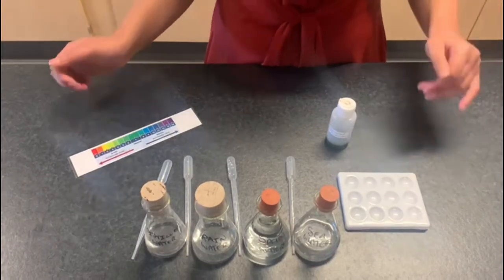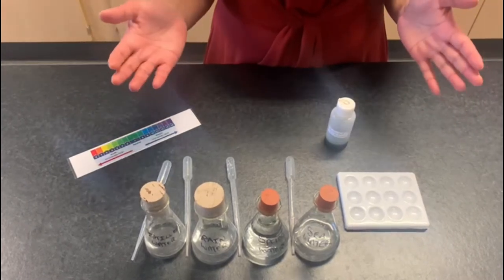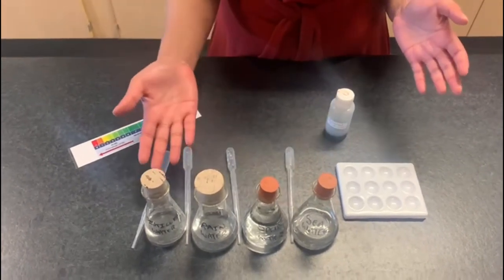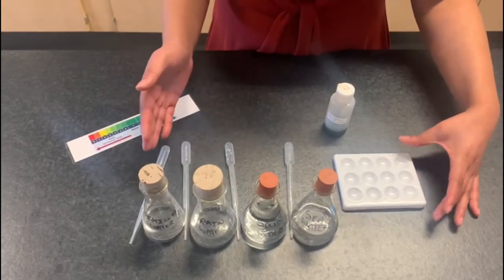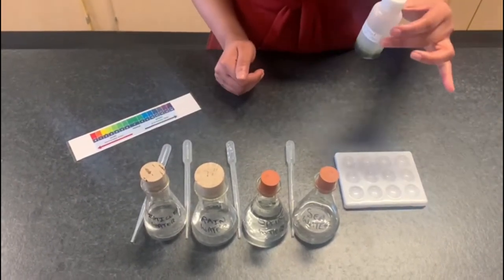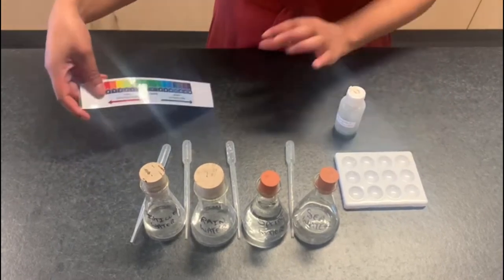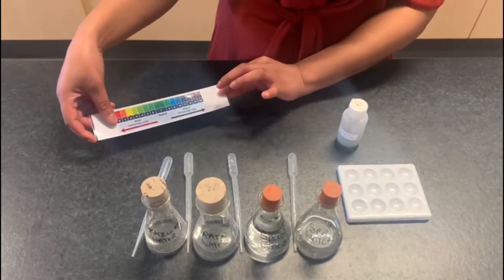In front of me I've got all the equipment we need for activity one. I've got the four different samples of water, a spotting tile, four different pipettes for each of the water samples, the universal indicator and the pH scale to check our results.